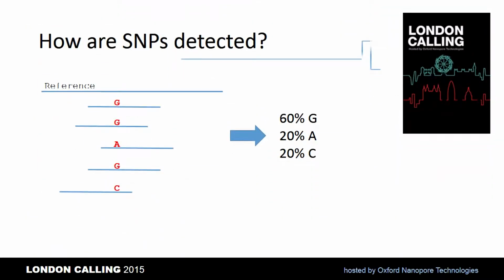To detect SNPs, most common bioinformatics tools rely on consensus. For example, aligning short-read next-generation sequencing data to a known reference, and then reporting the consensus probability of each base variant. Base-based consensus approaches are of course possible with nanopore data. However, tools designed for short-read data are not necessarily optimized for working with long-read, real-time nanopore data.